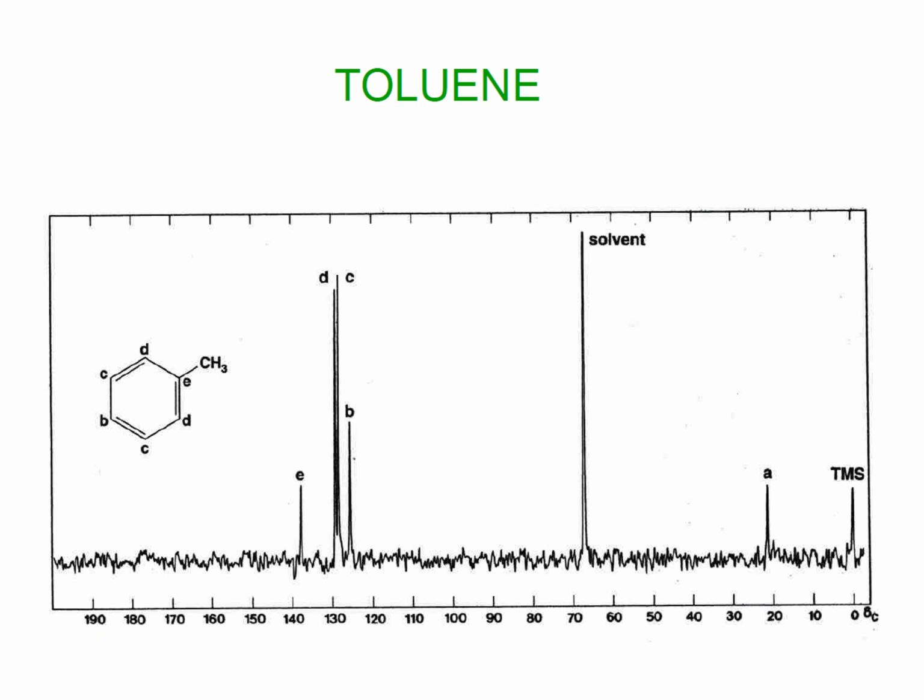Okay, so I think you can easily understand how we will predict the spectra. Now look at some peaks. First of all, TMS, tetramethylsilane, will be at 0. Now look at the environment. How many environments will we have? For the benzene ring, our peak appears between 100 to 150. We already know that for the benzene ring it would be between 100 to 150.